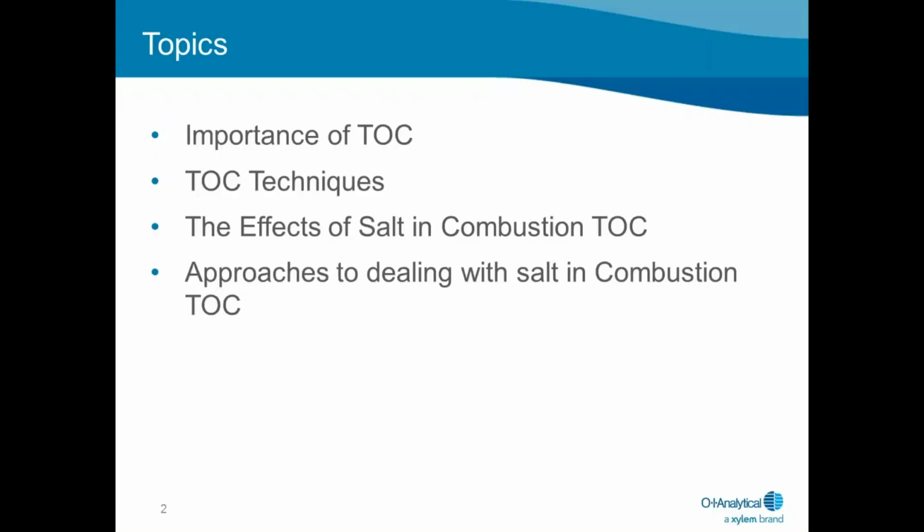In today's webinar, I will be covering the approach that OI Analytical employs for the determination of TOC on our Model 1080 TOC. I will touch on the importance of TOC, different TOC techniques, the effects of salt in TOC determination, and techniques that are used to mitigate the effects of salt.